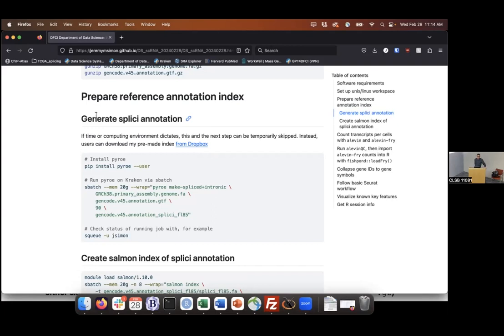No, not the barcodes, but just the amplicon UMI, the 12 nucleotides. But as that drifts up, I think there are some funny effects that happen. You mean if you sequence the library more deeply, or get more cells? No, if you get more amplicons and therefore you get more, then you'll have a better chance of getting thinly expressed genes. But you'll also wash out the top end.